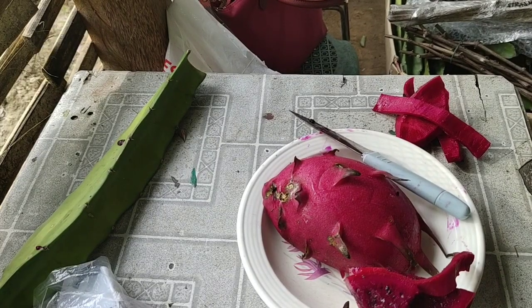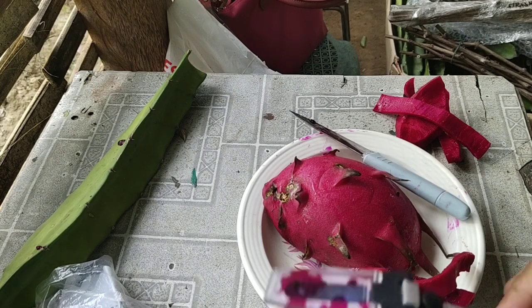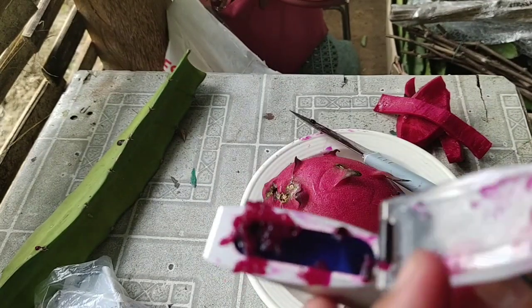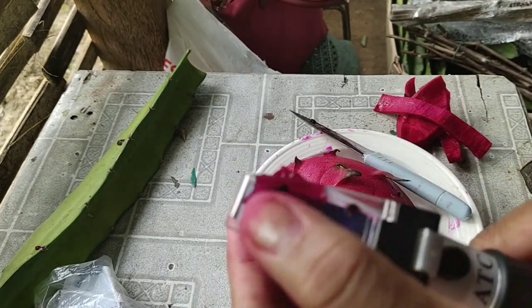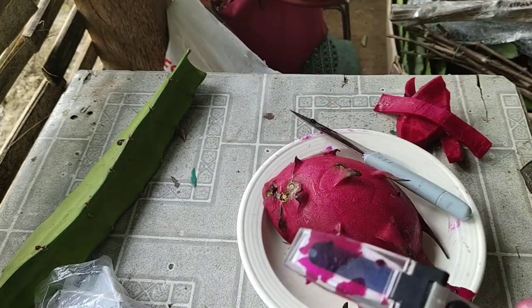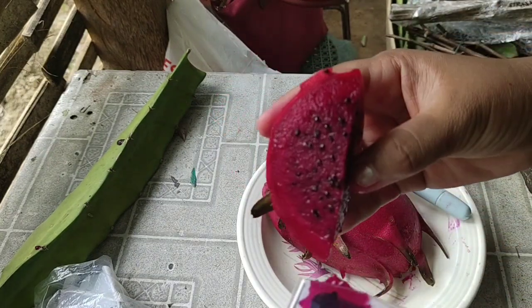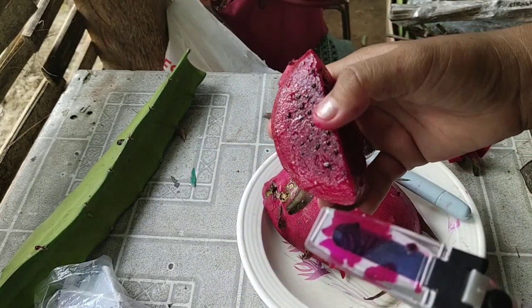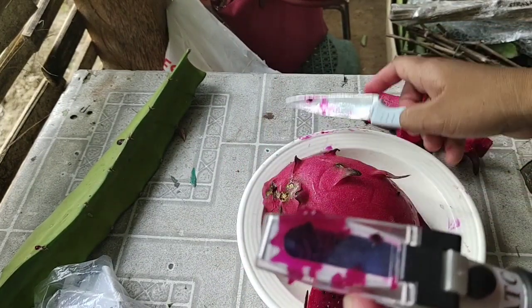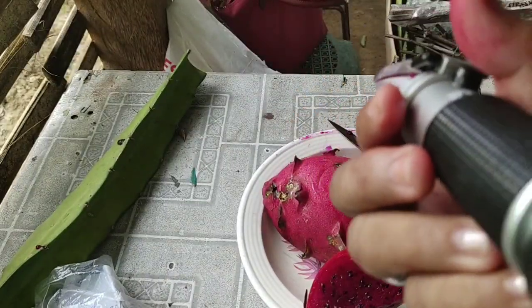Okay guys, so I'm doing a second Brix test. I already took the part from the center of the fruit and put the juice in there. So let's go ahead and try it — I want you to see the difference.